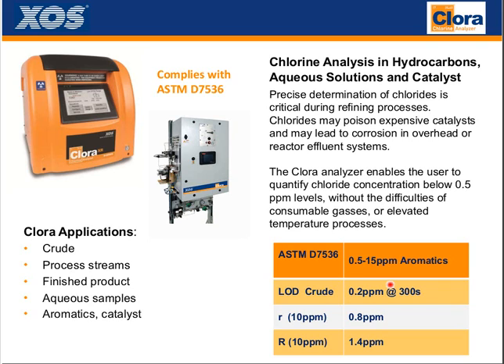The limit of detection for crude is about 0.2 ppm at 300 seconds. For other products, it's probably closer to 0.1 to 0.15, depending on the product type, and even depending on the sulfur content, because there is some level of interference from high percent levels of sulfur. You can see here that the repeatability at 10 ppm is about 0.8 ppm, and the reproducibility is 1.4 ppm at 10 ppm.